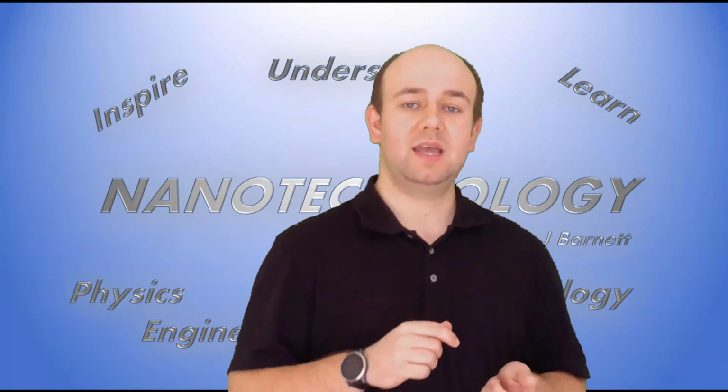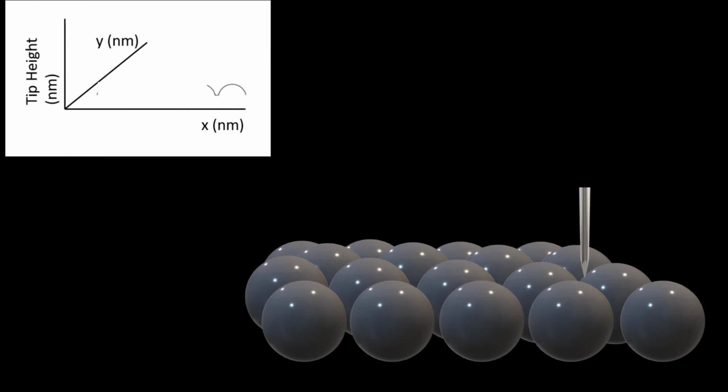Another mode we have is where you adjust the height of the tip to maintain the tunneling current. So the tip is actually now mapping out the surface, and this is the difference between two modes called constant height mode and constant tunneling current mode. Again, if you look at this animation, you can see the tip moving along, adjusting its height so it always maintains the same tunneling current, and this is what maps out where the atoms are in a surface.